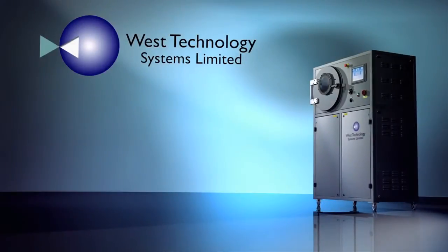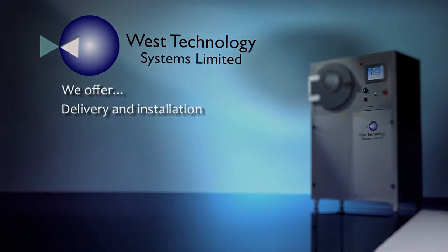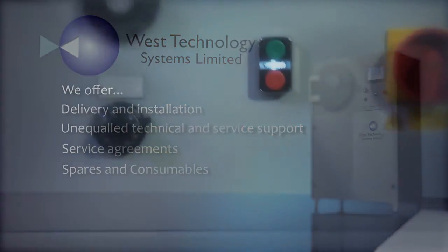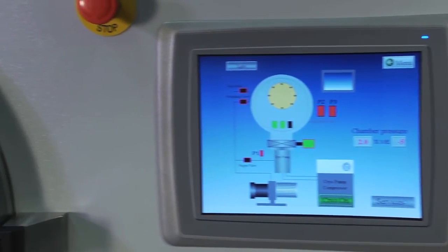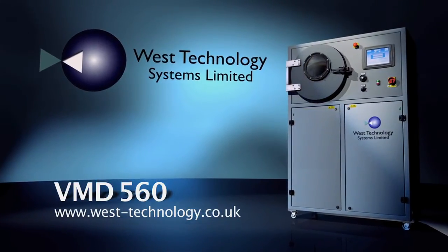West Technology is the leading expert in VMD systems and the only company that can provide the complete package. We offer delivery and installation, unequalled technical and service support including remote system diagnosis via the integral modem, service agreements, spares and consumables. The West Technology VMD560 is a unique unit with an easy-to-use control interface, compact footprint, and low maintenance design that provides all the benefits of vacuum metal deposition for today's forensic or police laboratory.